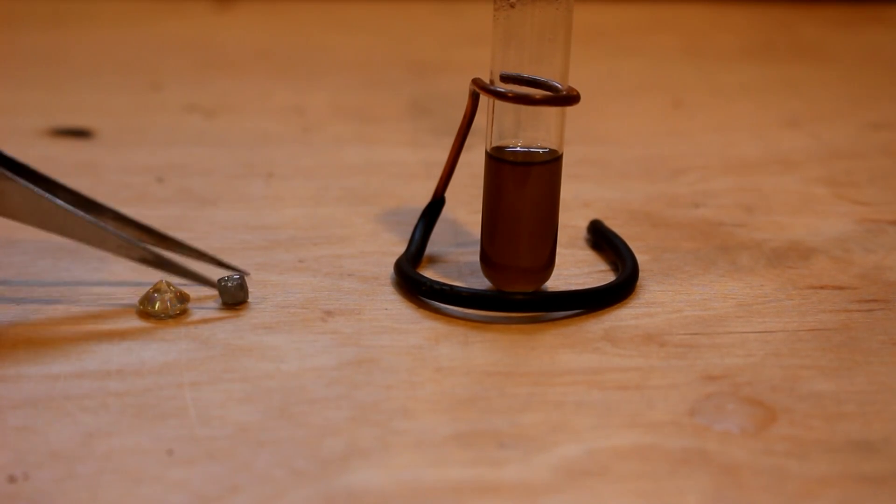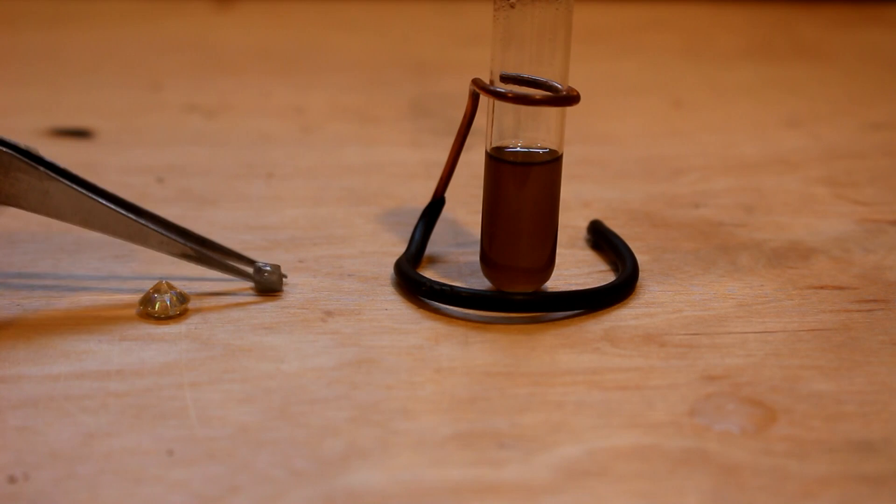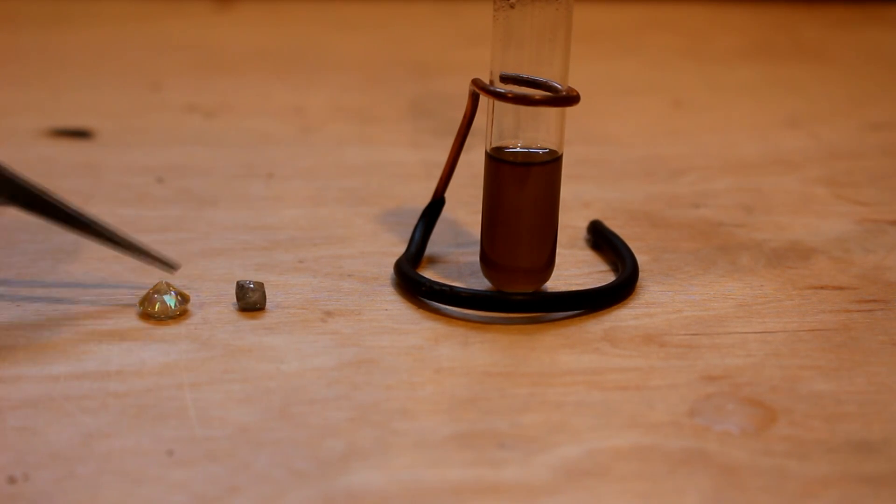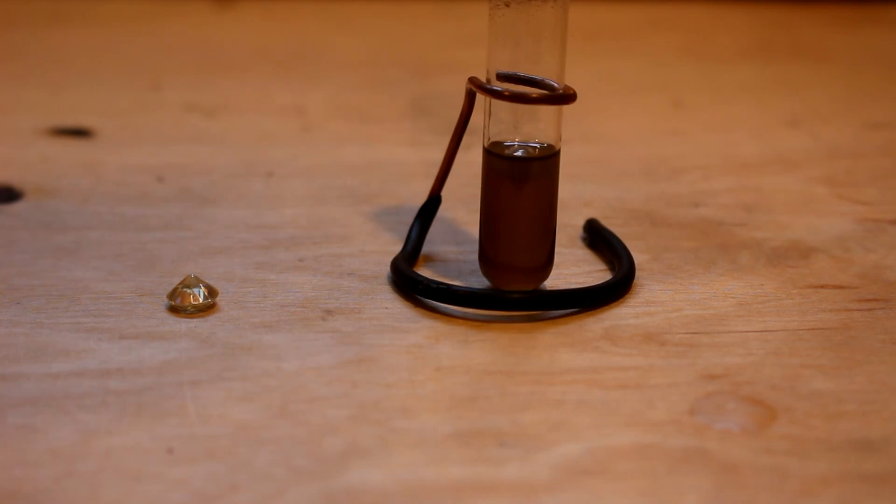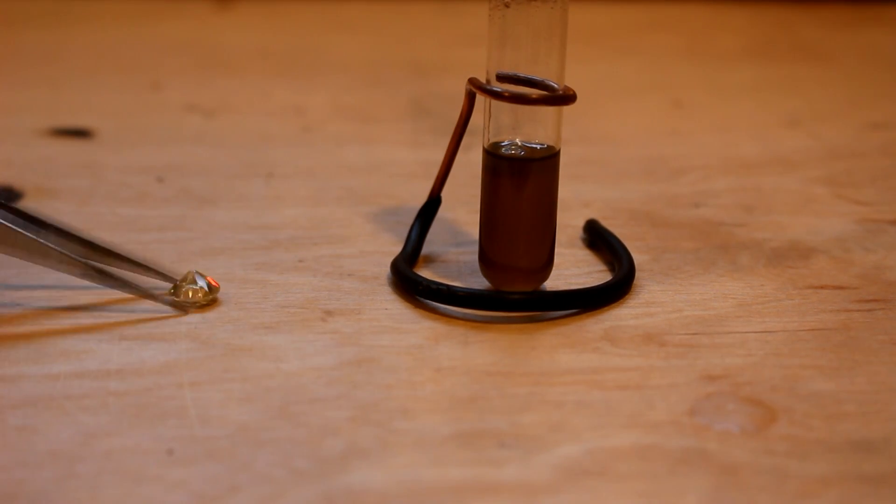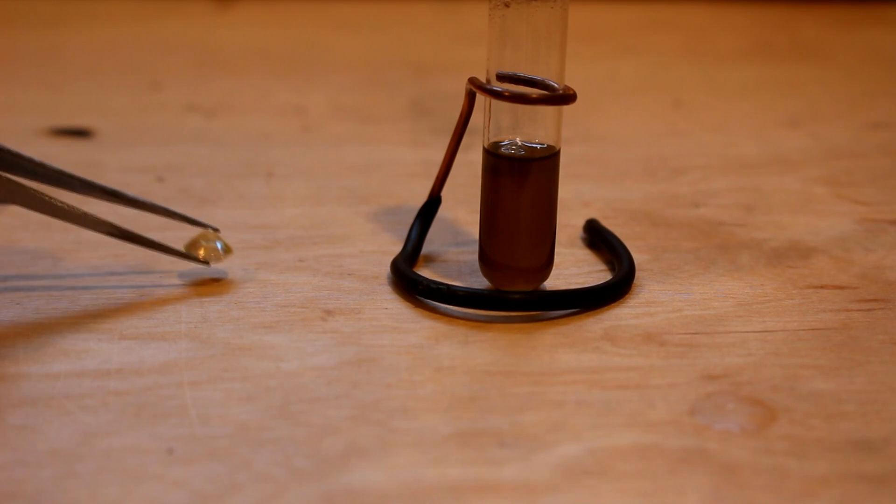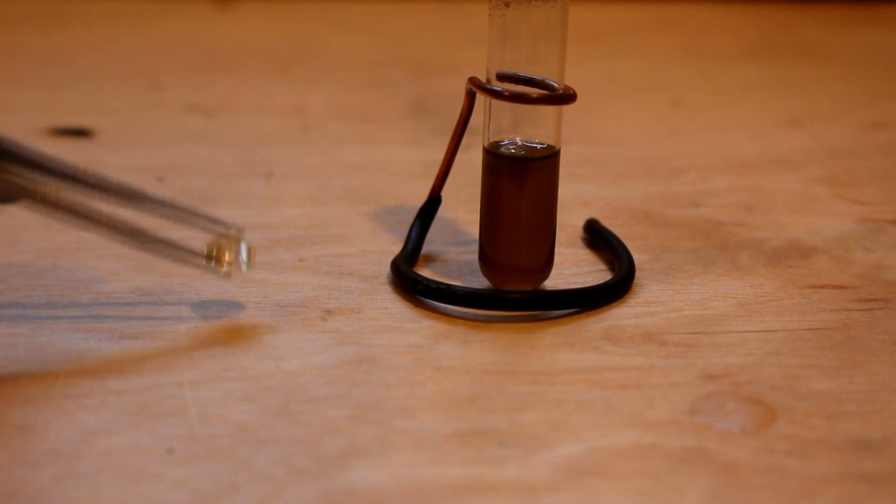Today, though, I'm just going to do a sink or swim analysis to see whether I have diamond or cubic zirconia. Let's put in the diamond. And of course, you guys know that one floats. And now the rock that I suspect to be zirconium dioxide.